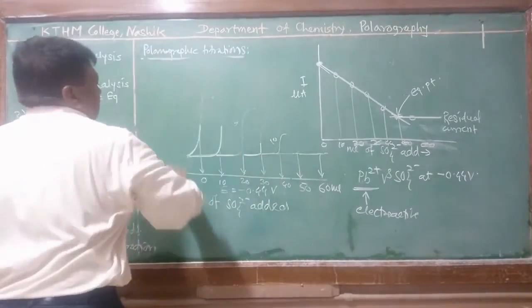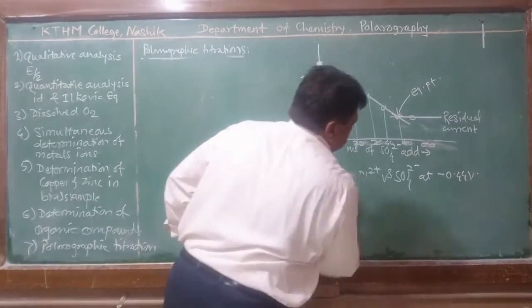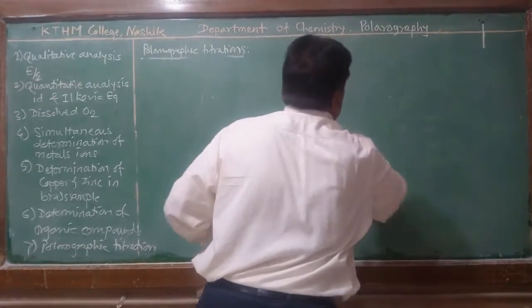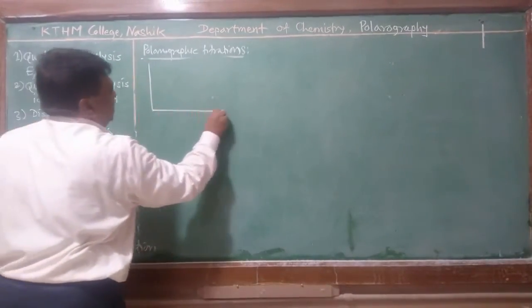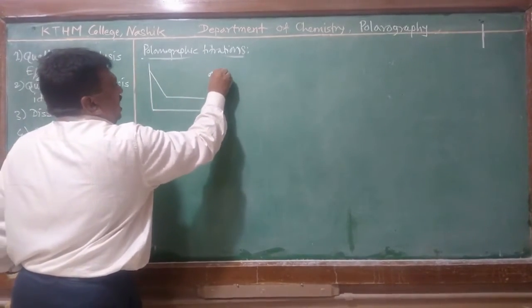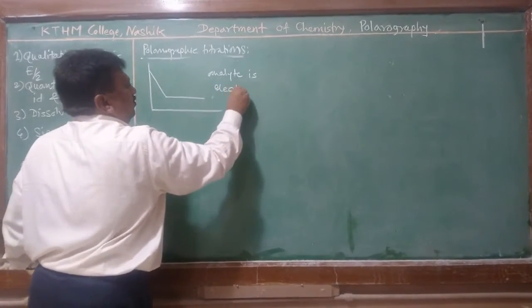Suppose, for example, we have different titration curves. Suppose we have the first titration curve in this fashion. Here only the analyte is electroactive.